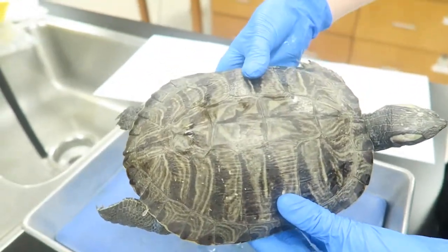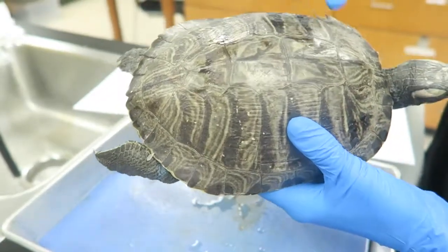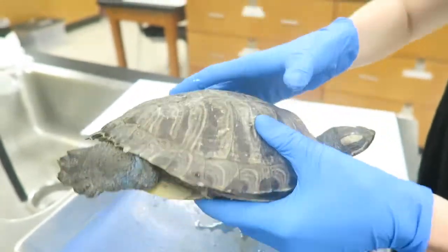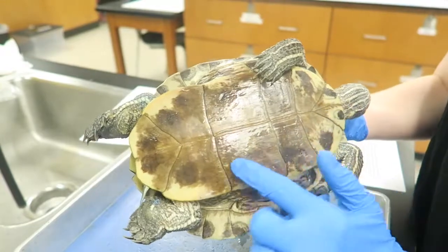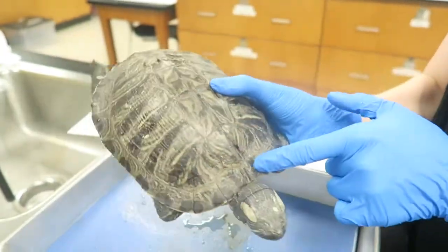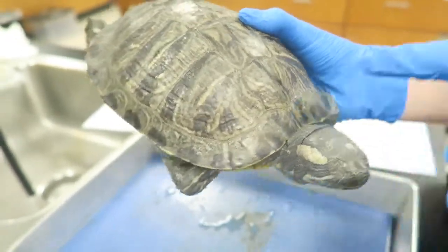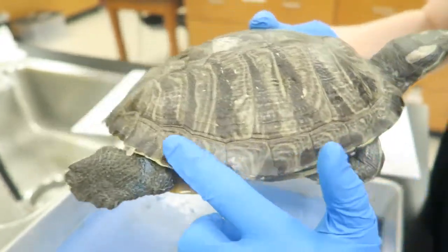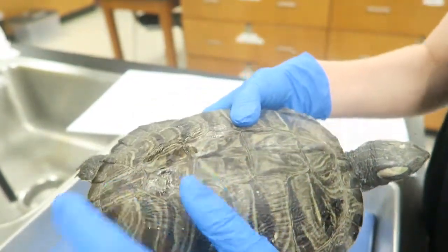Turtles have counter shading, which means that the dorsal side is different from the ventral side. In this turtle, the dorsal side is a lot darker, which helps it blend in in its terrestrial environment, and the ventral side is a lot lighter, which helps it blend in when it's in the water. The most anterior scute is called the nuchal scute, and then there are the marginal scutes which line the carapace, the costal scutes, and the vertebral scutes.